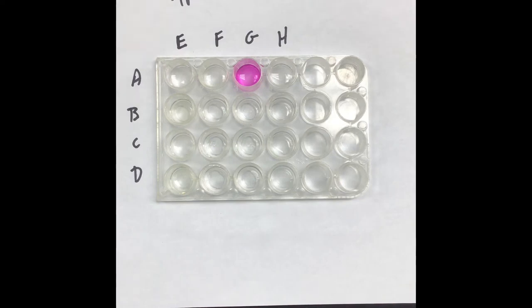I'm going to move on with B. Now, this is really not an instructional exercise. I'm just giving you guys data. You guys got to figure this out on your own. So we're going to do 10 drops of B all the way across. That's 10. That's 10. That's 10. Okay, so that's 10 there as well.